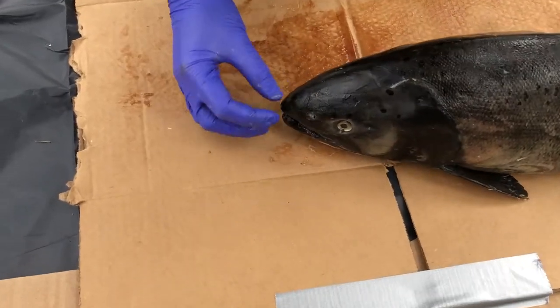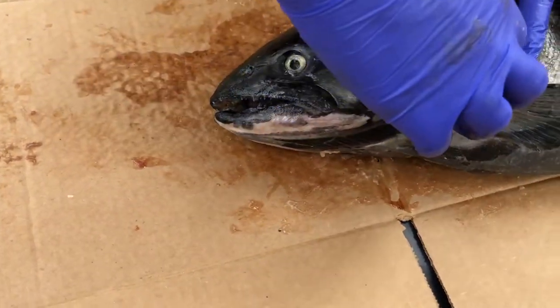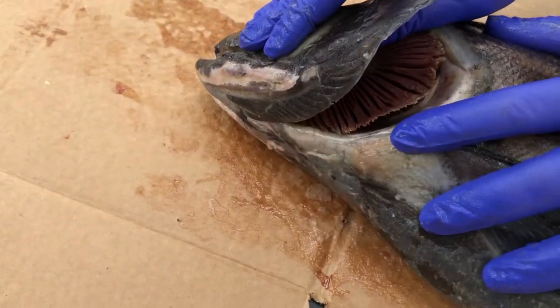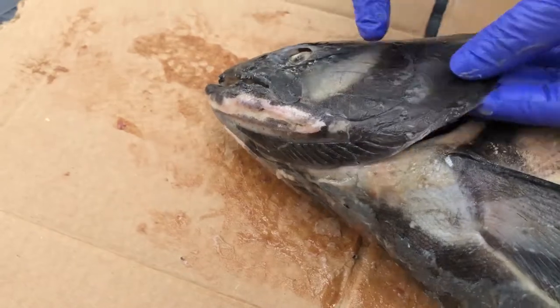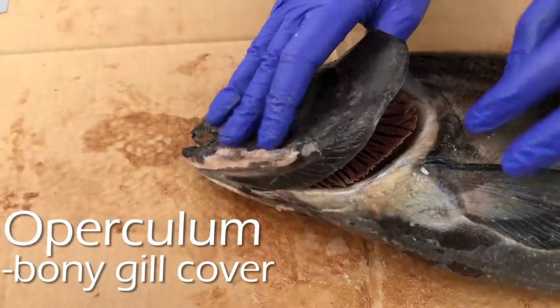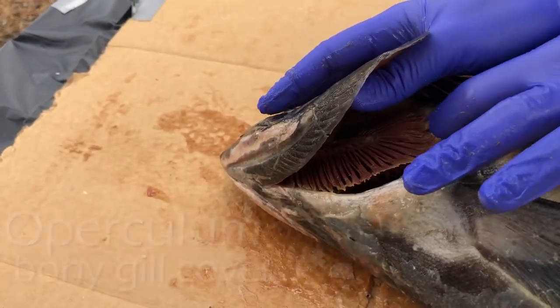Unlike humans who breathe through their nostrils, salmon breathe through their gills. This structure here is called the operculum — it's the bony plate that covers the gills. I'm going to cut out some of the gills so we can see them a little bit better.